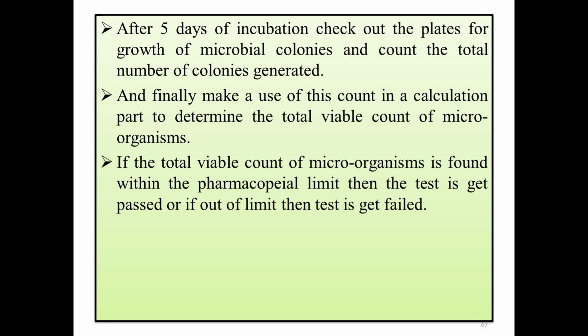We'll count how many colonies are there. That will be helpful in the final calculation of the total viable count of microorganisms.